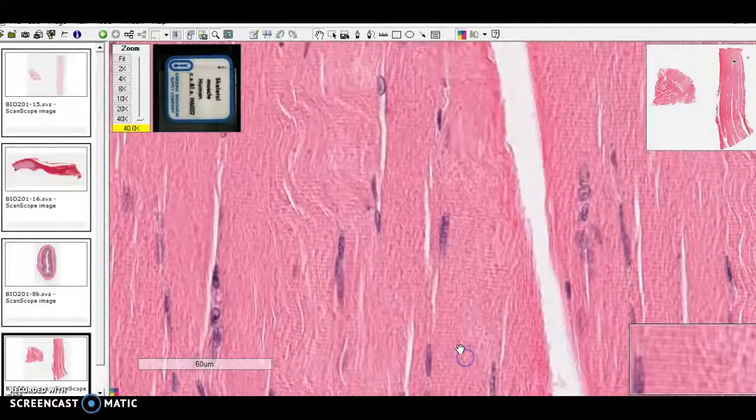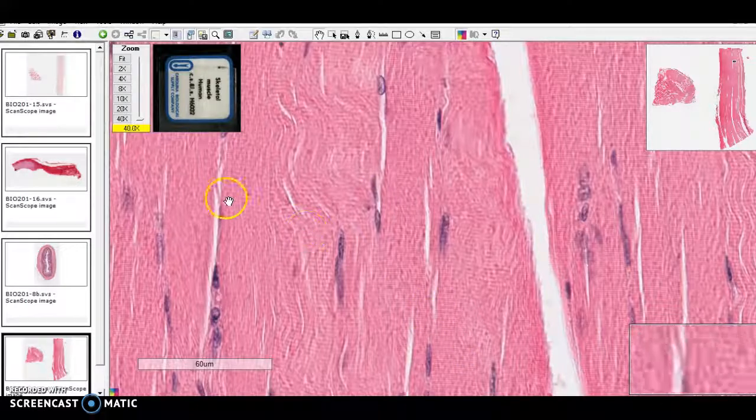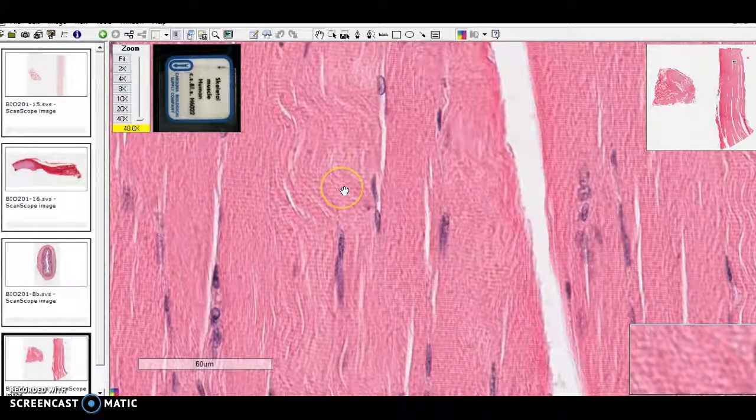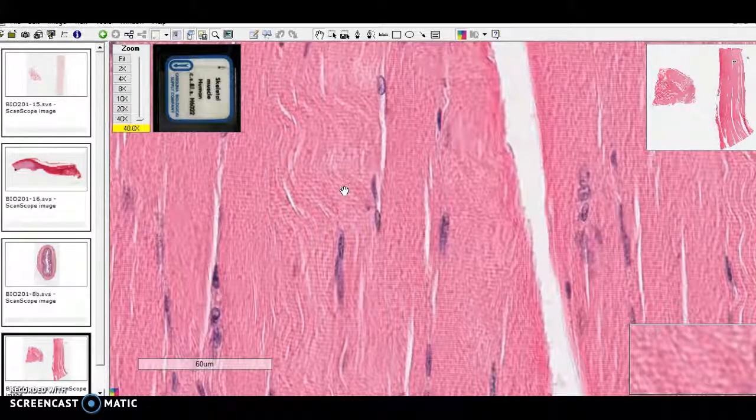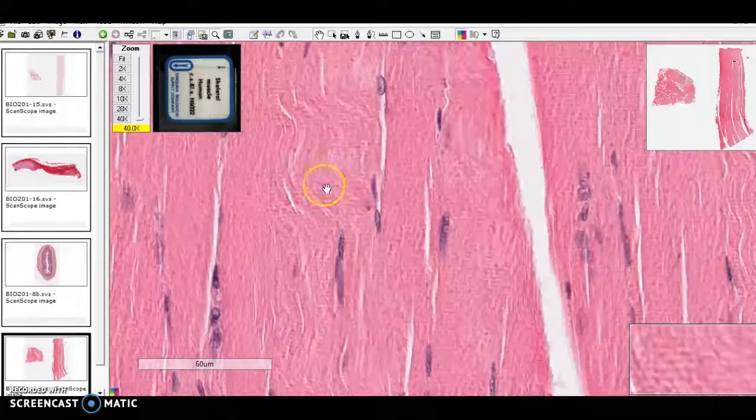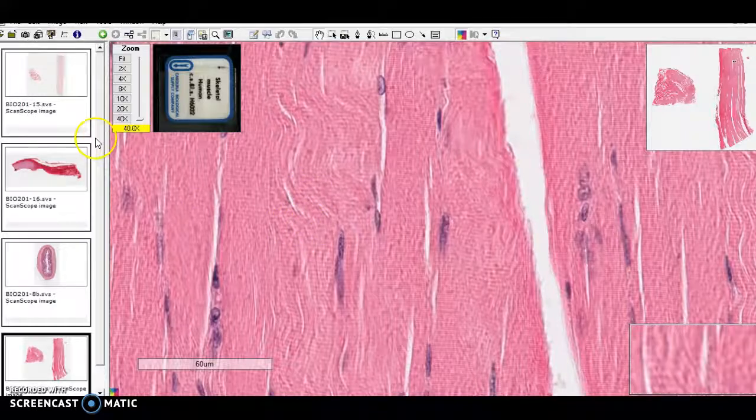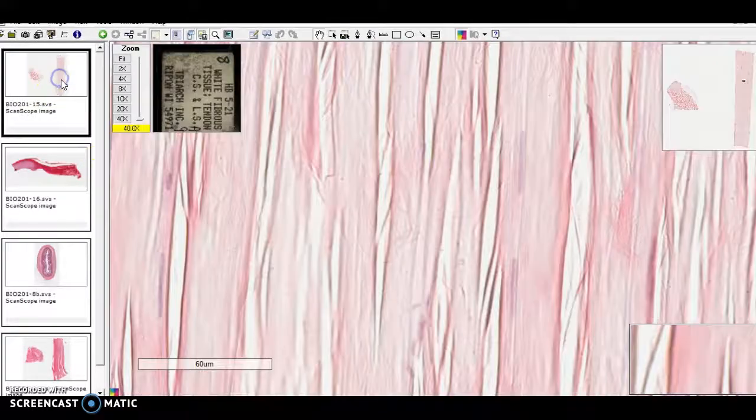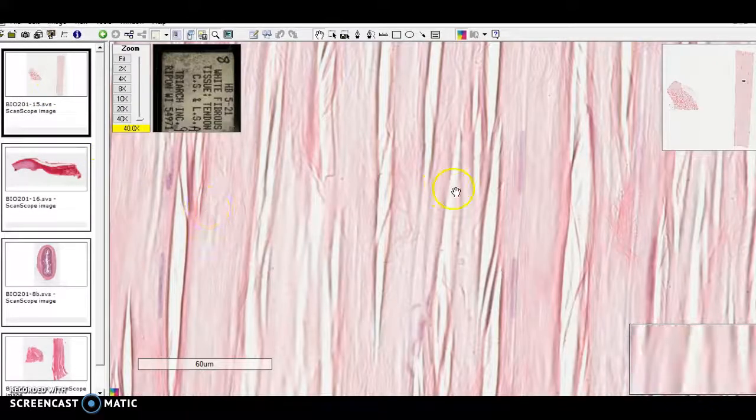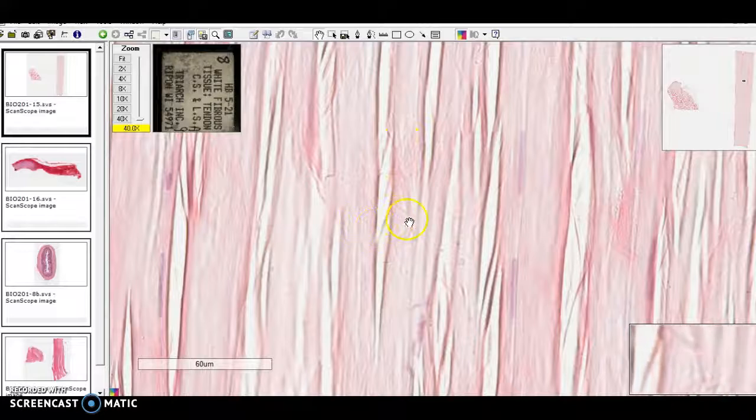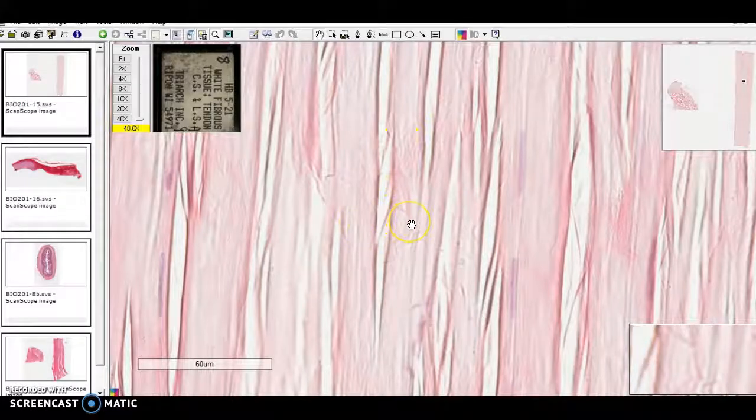When you see those, you know that it has to be either cardiac muscle or skeletal muscle. So that will be one hint that will help you distinguish this from dense regular connective tissue.